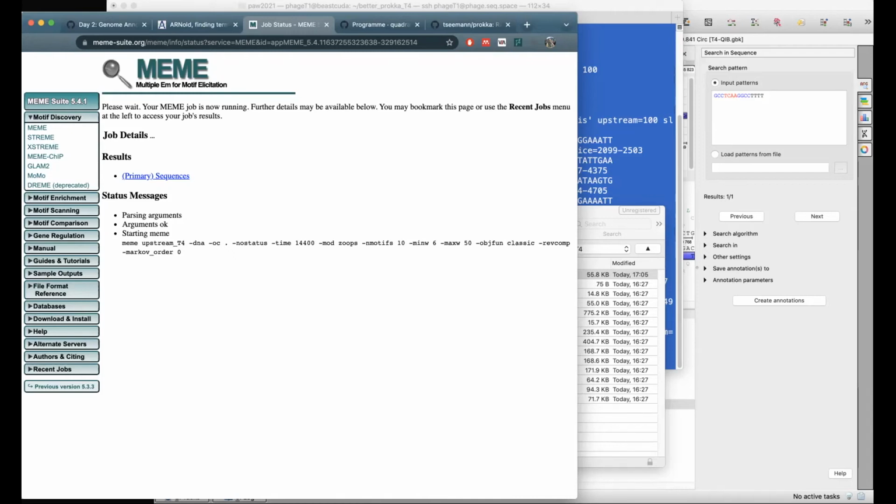In terms of the biology, the most important thing is that you can, for example, define operons of genes together. Or take the T7 promoter, which I'm guessing is one of the most used promoters for molecular biology.